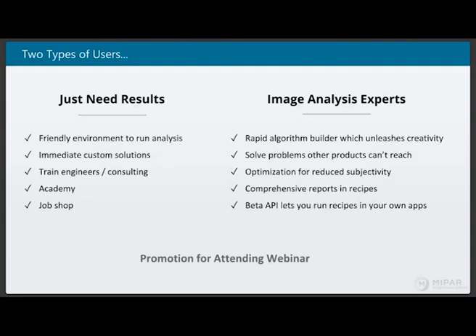That's also maybe a good moment for me to mention that anyone is always welcome to send us a sample image for a recipe. If you go to our site at mipar.us/try-image, or just go up to the navigation bar under recipes and select Get Custom Recipe, we get hundreds of submissions from folks looking for a rapidly built custom solution that we can often turn around in sometimes a few minutes.